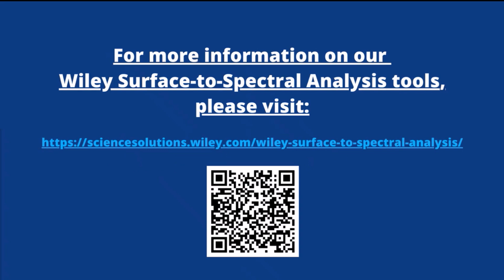So when baseline correction is performed, it can sometimes make certain peaks more predominant overall, but it would be a matter of figuring out which pixel locations within the hyperspectral image those peaks came from. They would have been there before. Baseline correction just changed the average display. Thank you, Liana.